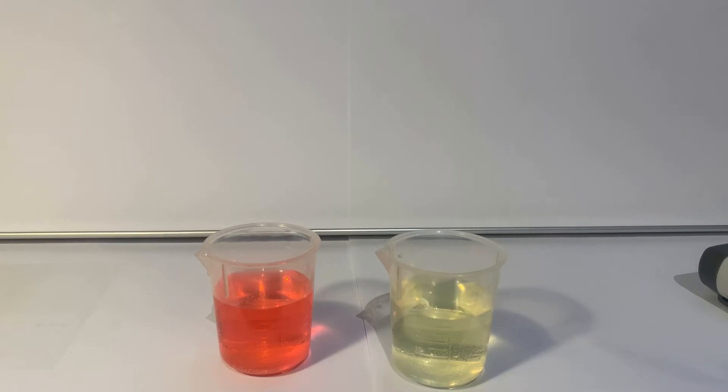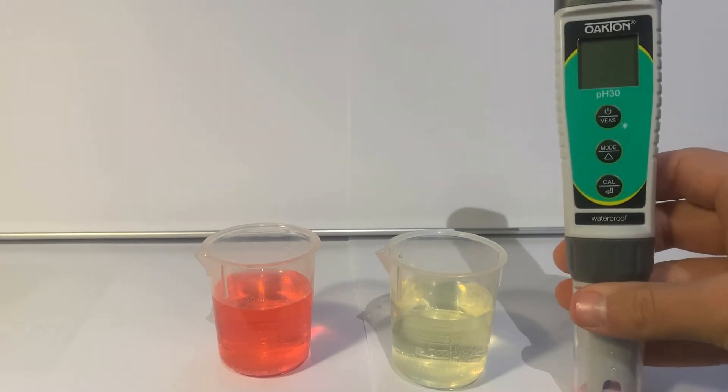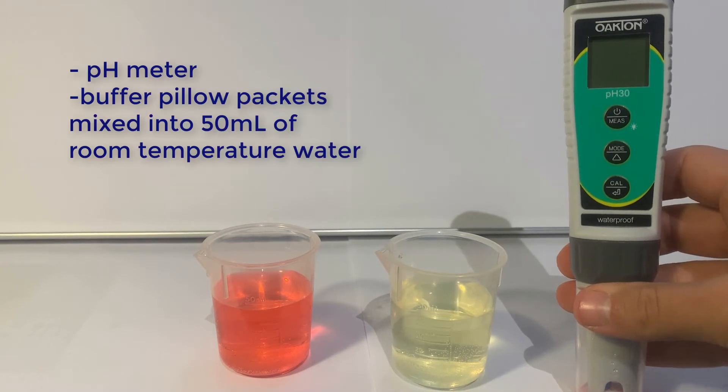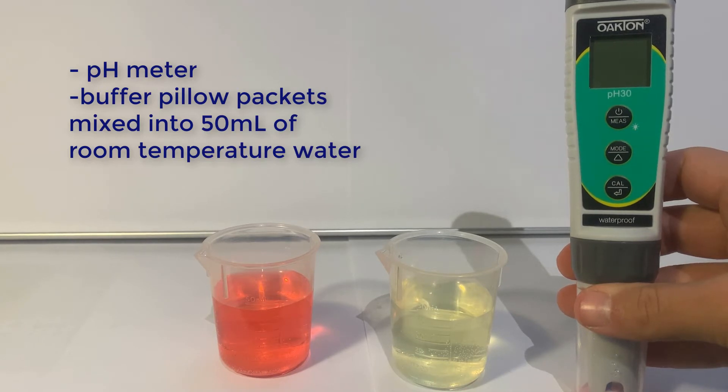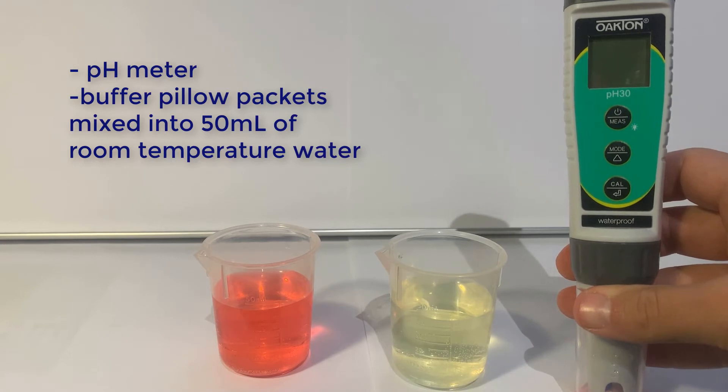The process is the same as the older meter, but the buttons are slightly different. You will need your pH meter, your pillow packets that bracket your normal reading mixed into 50 milliliters of room-temperature water, and a cup of water or your squeeze bottle to rinse off your probe.